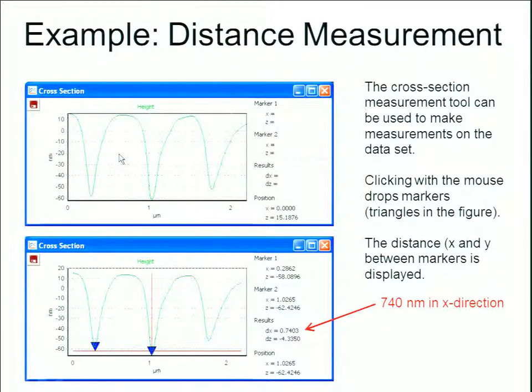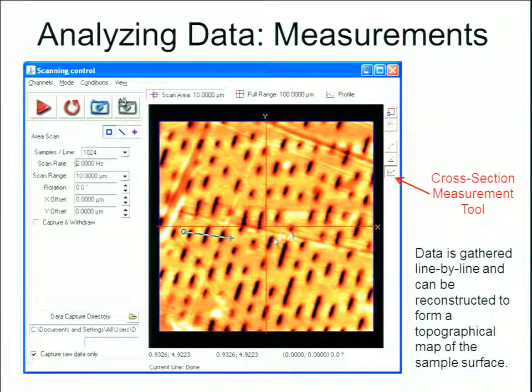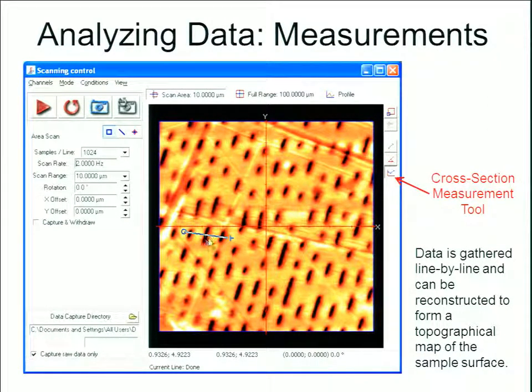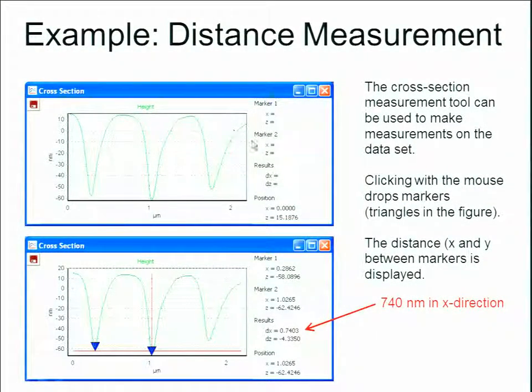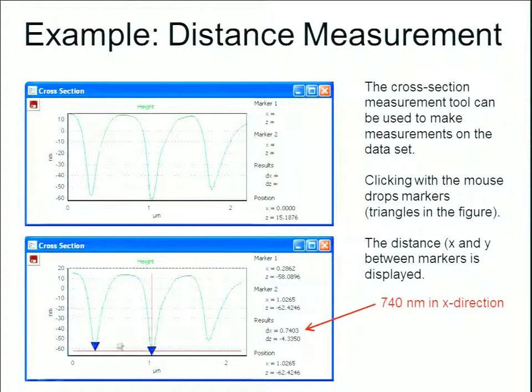When you let go, you see an extremely accurate profile of the topography along that line segment. Going back to our DVD scan, we click and drag and see the pattern: plateau, well, plateau, well, plateau, well. You can do a quick measurement for sample height or distance. In this case, we see the pitch distance — the distance between the tracks on the DVD — about 740 nanometers.